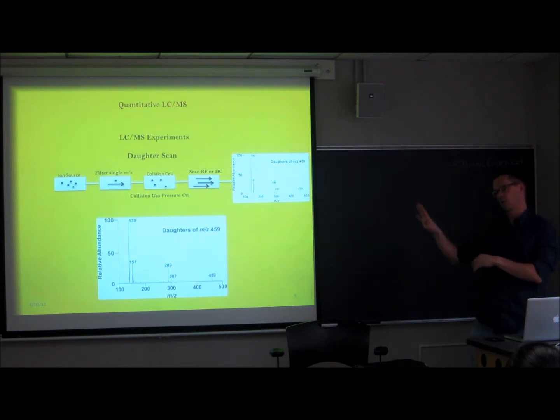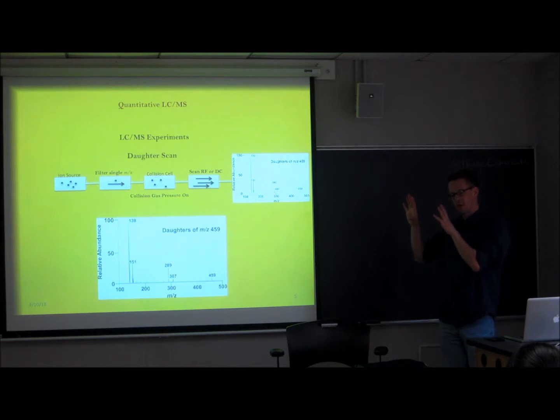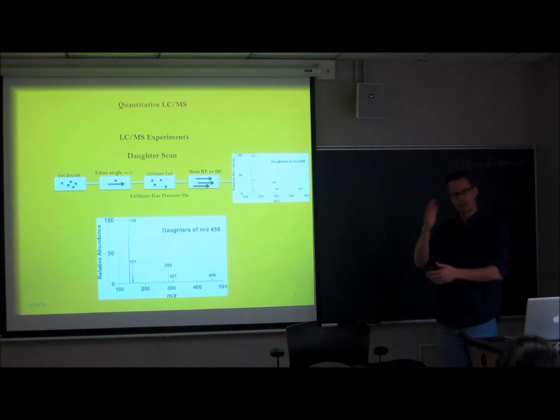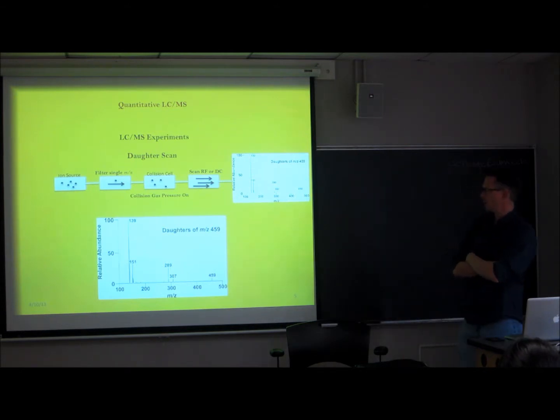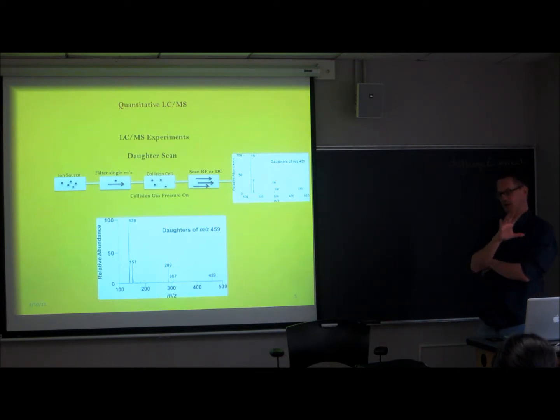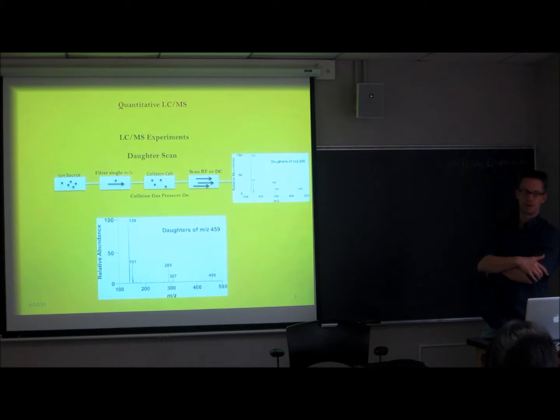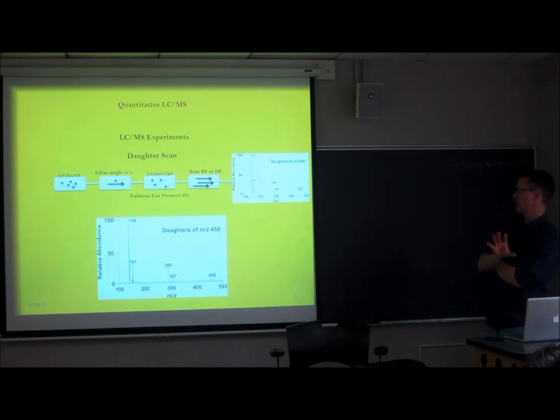The other thing I'm going to focus on: I talked on Monday about the different experiments you can do, just a full scan MS mode, and selected ion monitoring where you're just monitoring one ion. And I also talked about multiple reaction monitoring, where you're taking advantage of a dual mass analyzer mass spec to get 2 dimensions of selectivity, 2 dimensions of separation based on the unique mass of components of the analyte you're interested in. So the examples I'll give, we're going to talk about LC-MS-MS.